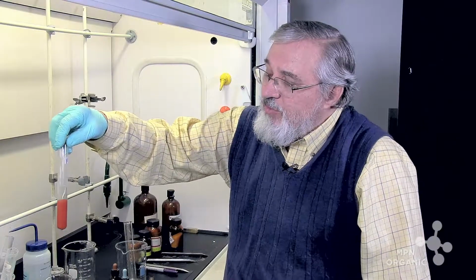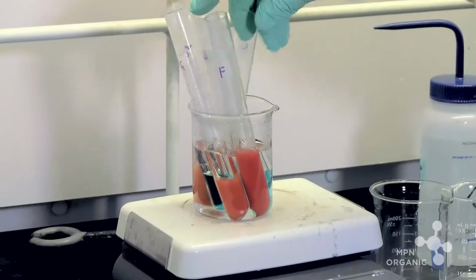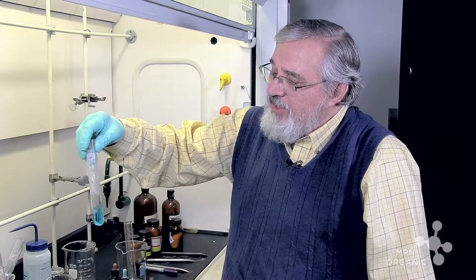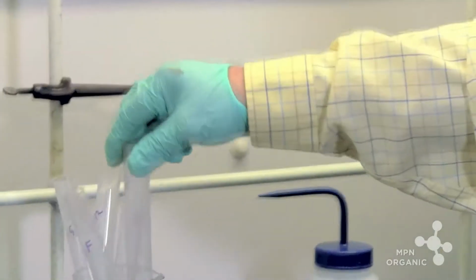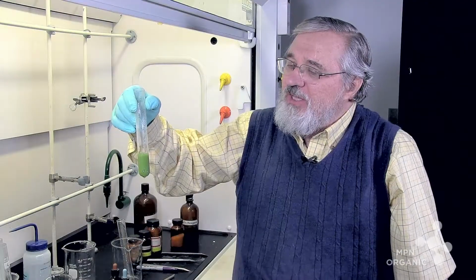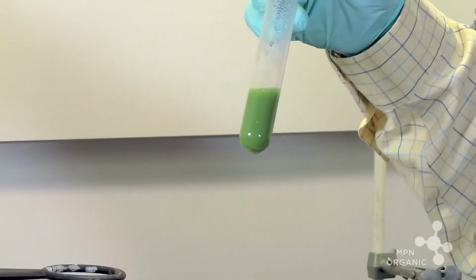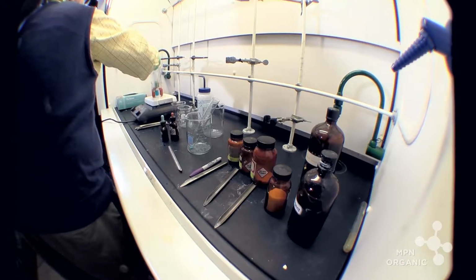Fructose itself do indeed change the copper 2 ion to copper 1. And let's give this a little time for it to convert. The pre-treatment with sulfuric acid actually had something to do with the color change that we're seeing right now.